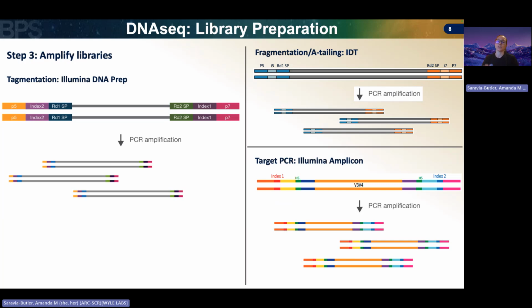I should also mention, throughout the library preparation, you'll notice in each step we were adding things like the extra pieces of our adapters, sequencing primers, etc. So after each step, it critically undergoes a wash step to remove any remaining adapters that didn't get added on to our unknown DNA template.